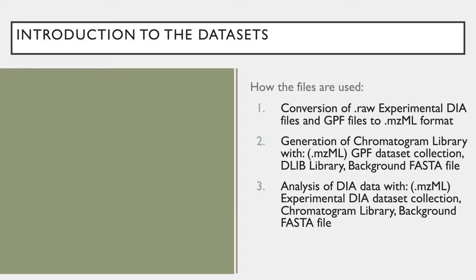The last two datasets required are a DLIB spectral or PROSIT library and a background FASTA file. These two inputs are both required in addition to the GPF dataset collection in generating the chromatogram library. Once the chromatogram library is generated, it will take the place of the DLIB input library, and along with the background FASTA file, it will be used in the quantitative analysis of the experimental DIA data.